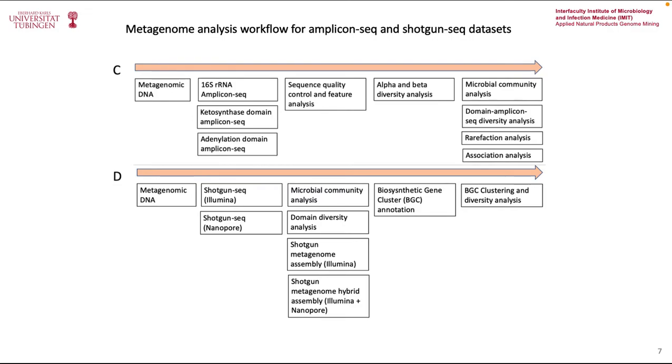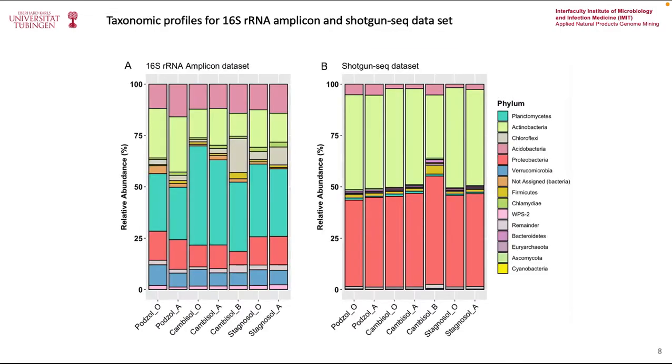The following metagenome analysis workflow was followed. Our major emphasis was also to compare the methods to identify their merits and identify correlation patterns that can guide the future natural product discovery surveys. I'm quickly highlighting some of our important findings.